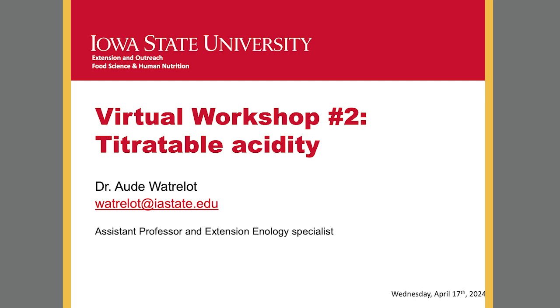Good morning, everyone. Today we're going to talk about titratable acidity, and it's a real pleasure to see that all of you are joining us and are ready to learn about how to measure titratable acidity, and to make sure you are able to use the tools and the knowledge in your own space, in your own winery or in your own environment. Because you will learn about the importance of titratable acidity.